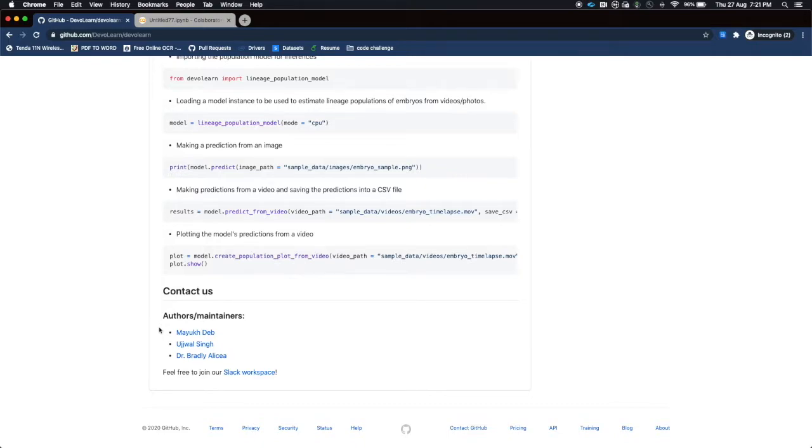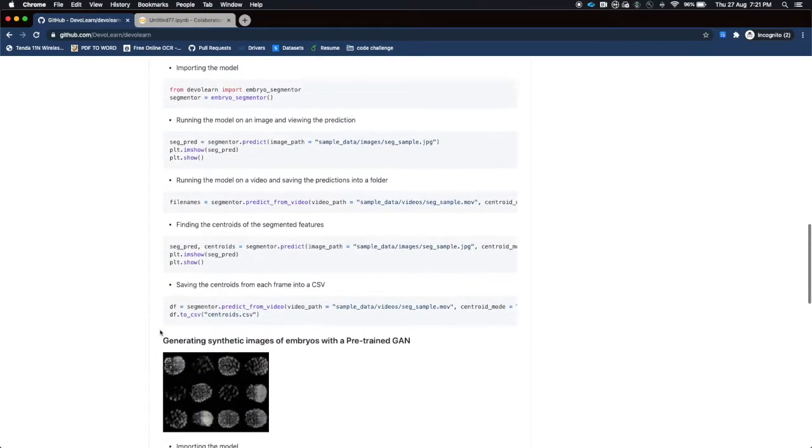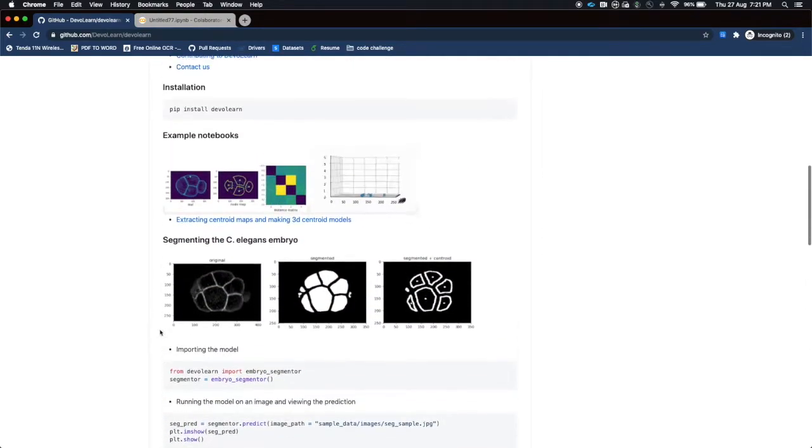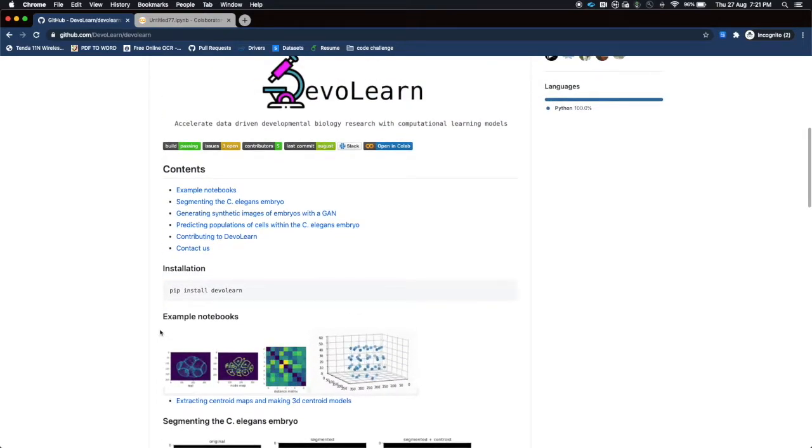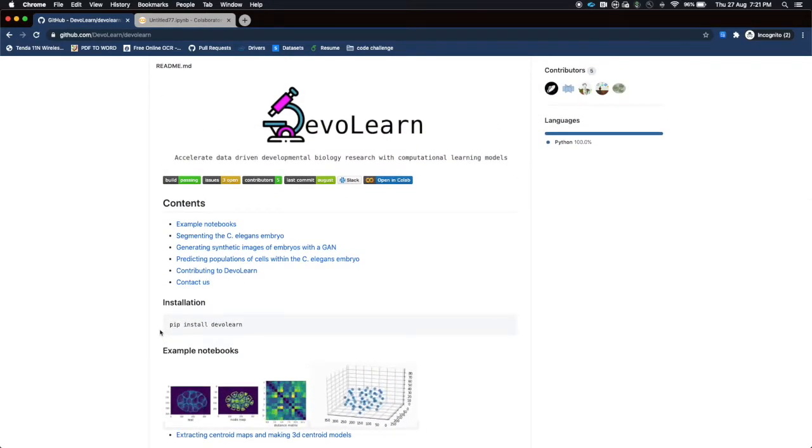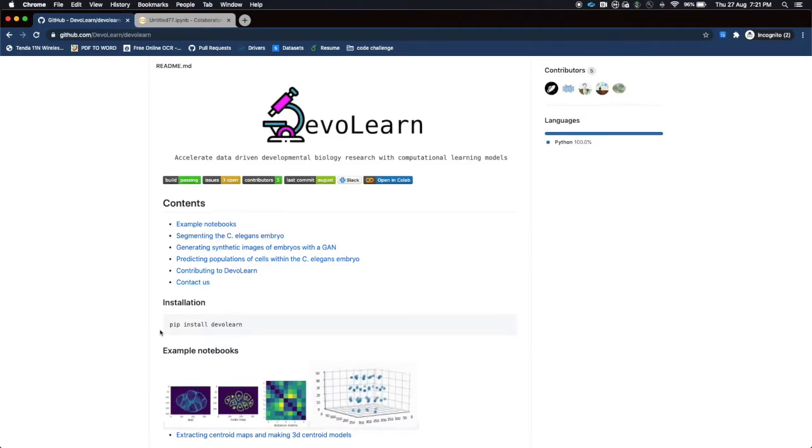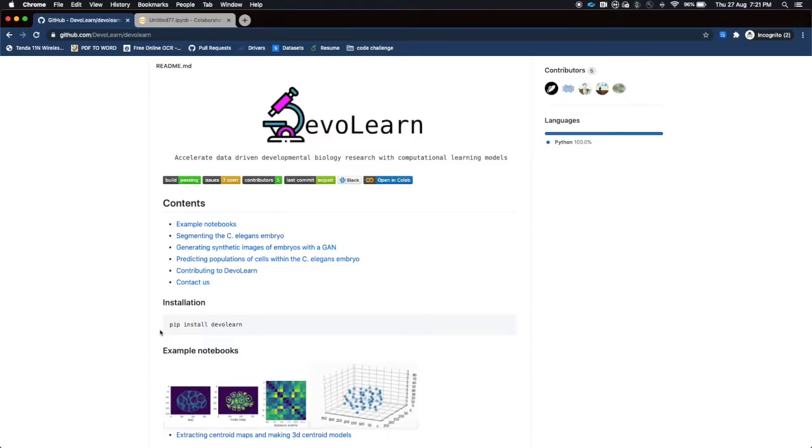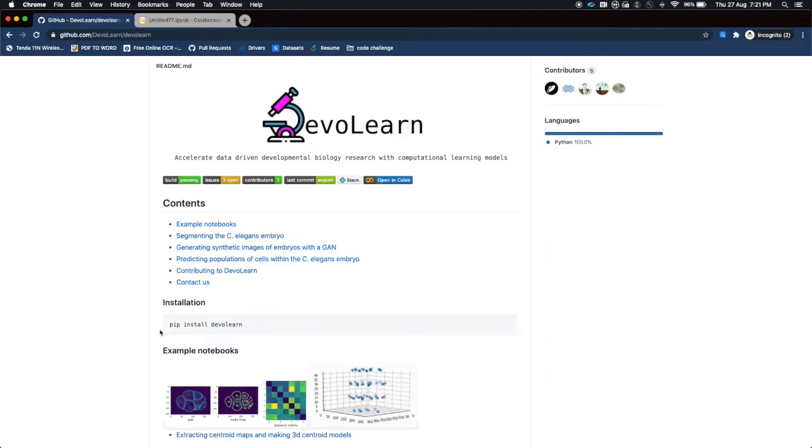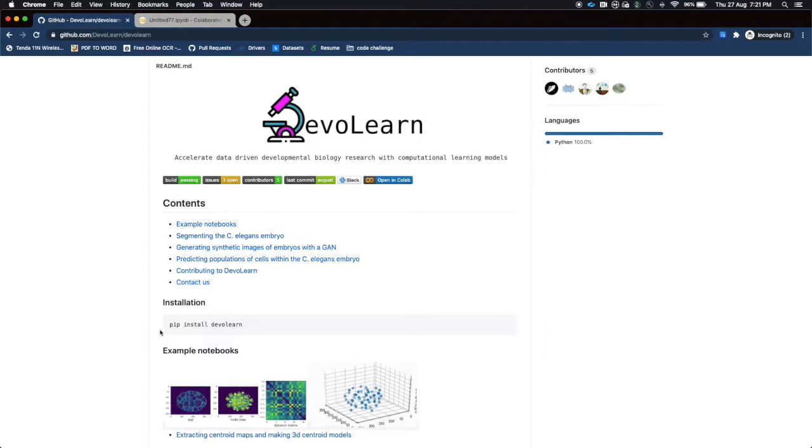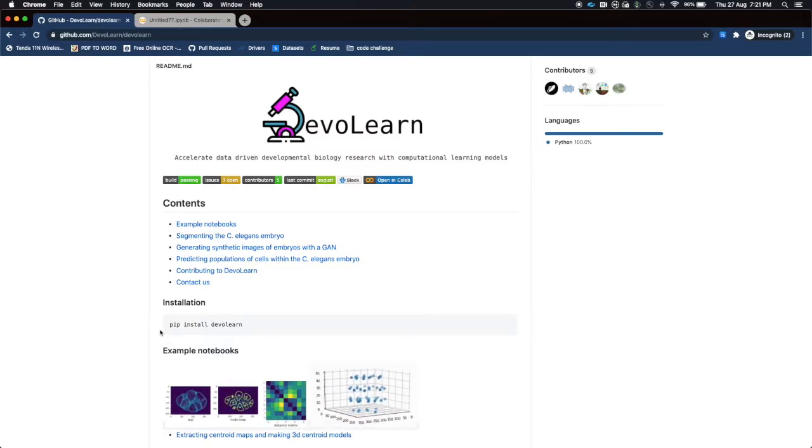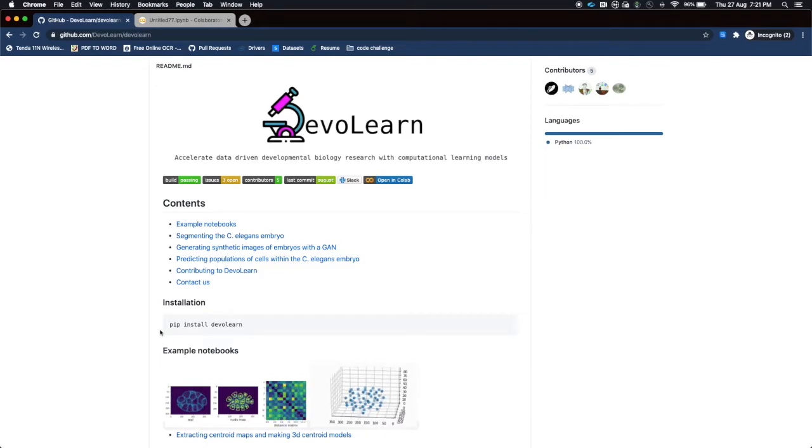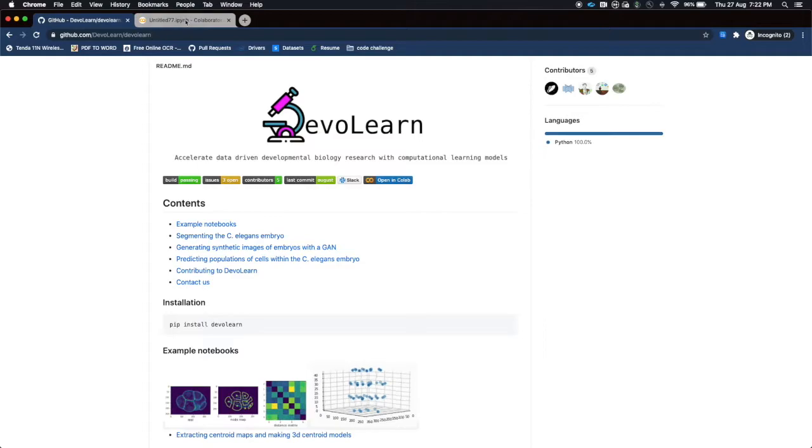Moving on. This tutorial is meant for people who are not very familiar with computer science, so I'm going to give you a brief walkthrough of how to use this library. It is focused to accelerate data-driven developmental biology research using computational learning models. Right now this library is basically focused on C. elegans segmentation procedure, so we are going to talk about it most of our time.